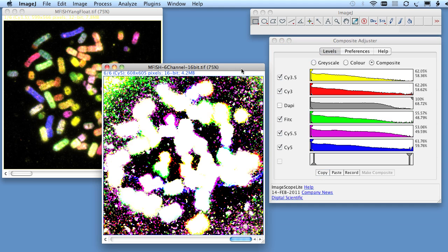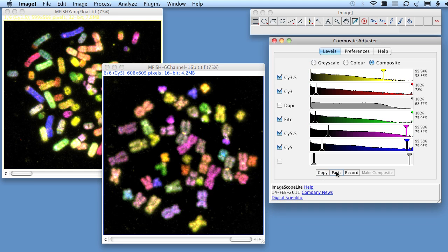so when we switch to our 16-bit data and paste it, we get an image balance which is similar to the first image.